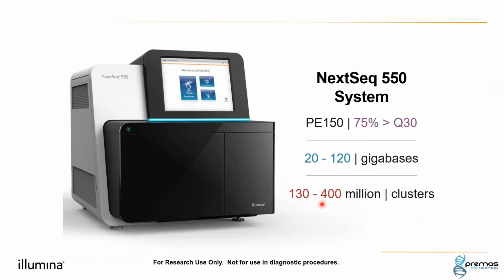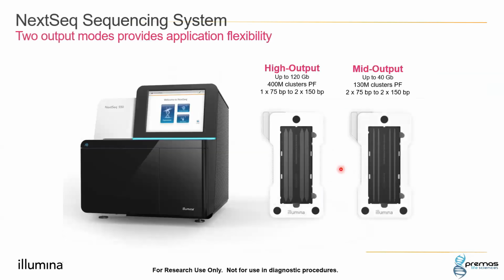This is where you will unlock certain applications that could not be done on the sequencers we have discussed previously. 120 GBs unlocks applications like transcriptome and exome sequencing. And if you want to go for a human whole genome, that can also be done, but only one sample. But yes, it offers you the capability of doing that.